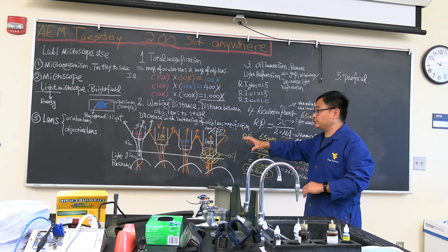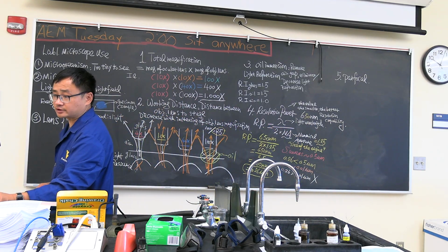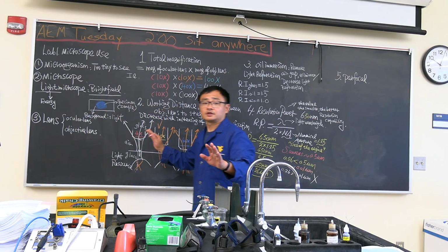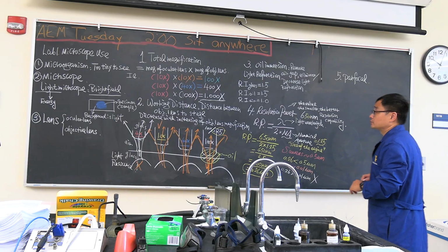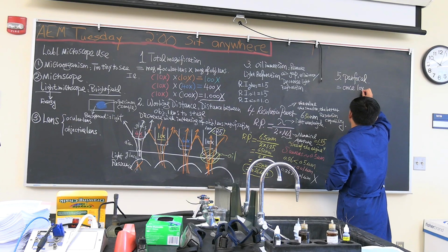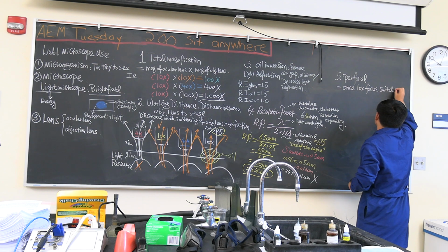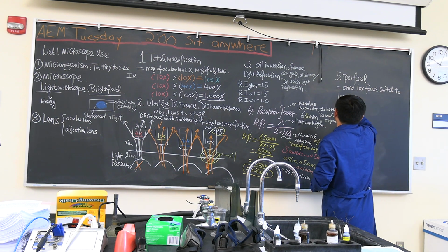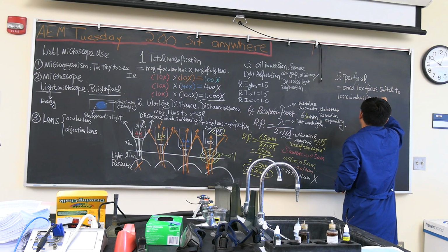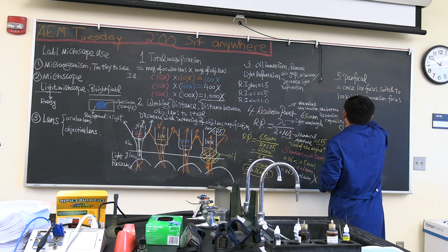You only need a very tiny adjustment, which means you only need to use the fine focus, the thin knob, to adjust a little bit. You'll finish the job. That is called parfocal, which means once 10x is focused, switch to 100x with oil immersion, focus stays.